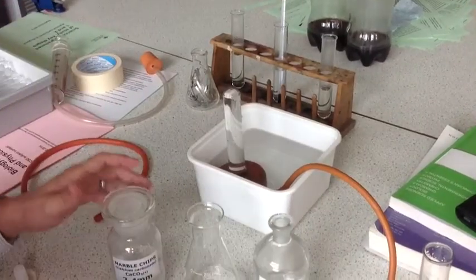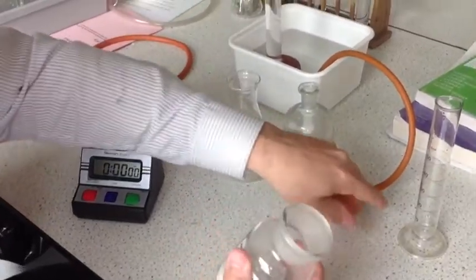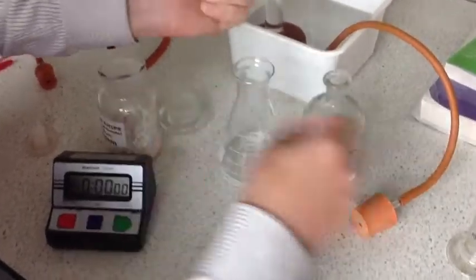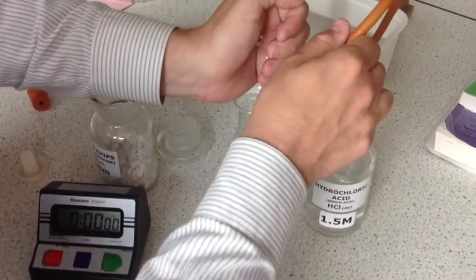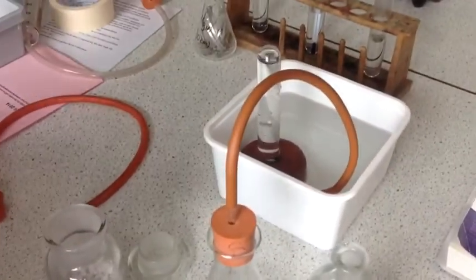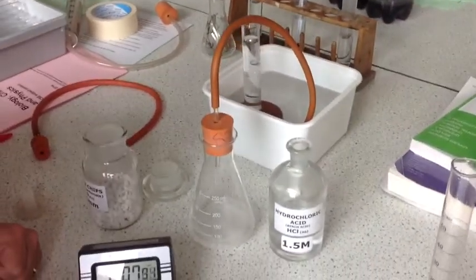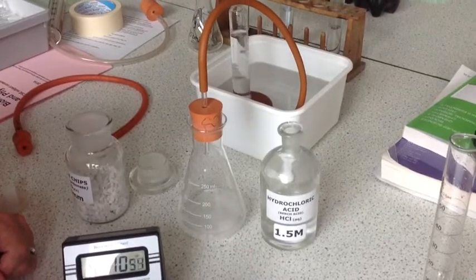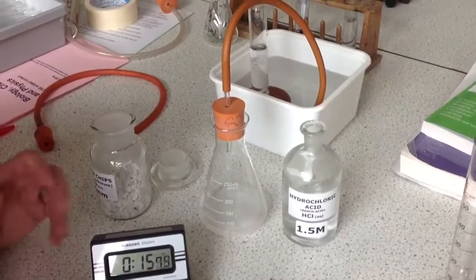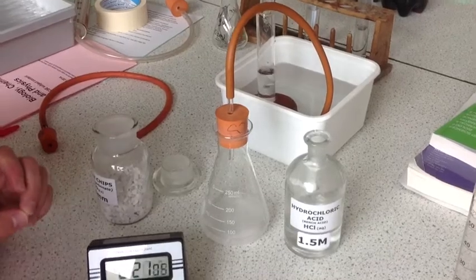This is another reaction that produces a gas. Reactions that produce gases are quite easy because obviously you can measure the gas that is being produced. These are marble chips or calcium carbonate. When you add this to acid, carbon dioxide gas is produced. So if I add that in there and put that in, I can do exactly the same method as I did before with hydrogen, collecting the amount of carbon dioxide gas that's produced. This isn't measuring an amount of carbon dioxide gas, it's a really straightforward, simple comparison of the amount of time to produce a certain amount. So it is doing a measurement, but it's a simple version of a measurement technique.